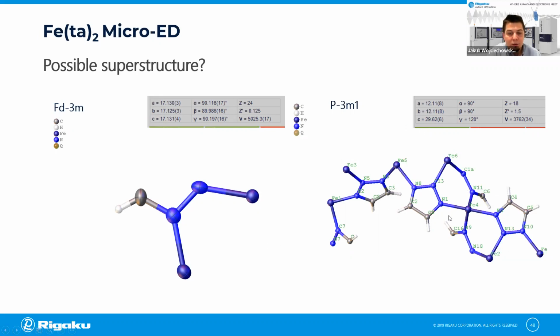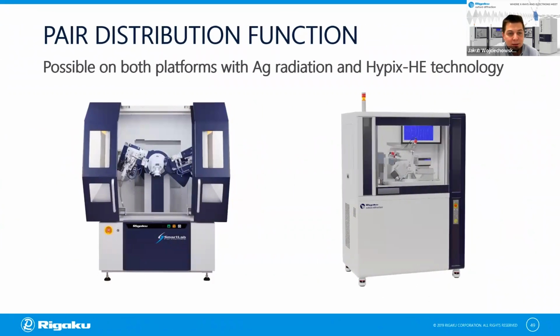So the coordination falls around now 6 iron atoms, not 2, without much difference. So we're still wondering if it's actually a proper solution or just an element of the sample decomposing in the beam. We discussed what to do with it, and we figured out that we can run the pair distribution function of this material.